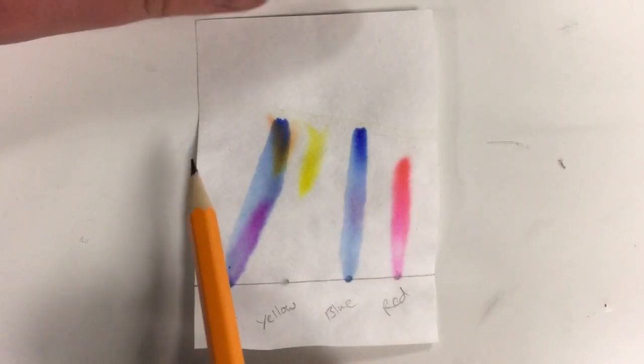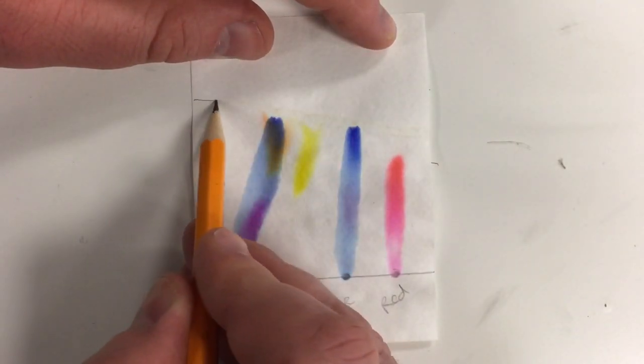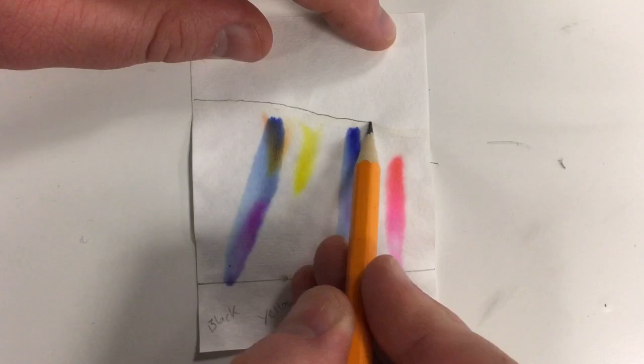Using a pencil you should now label your solvent front. This is the point at which the water solvent moved up the paper and stopped.